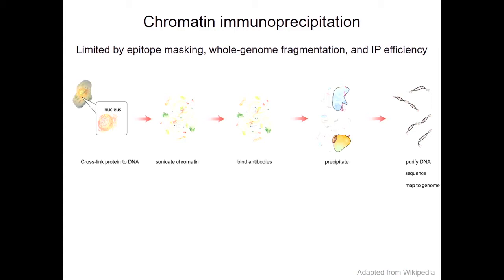The method in general is that you take a cell you're interested in and you immediately fragment all the chromatin in that cell into many, many small pieces. Okay? There are different ways of doing this, but the point is that now the whole genome is broken up into pieces. You have to delicately handle that in a test tube, and there are a lot of different pieces.